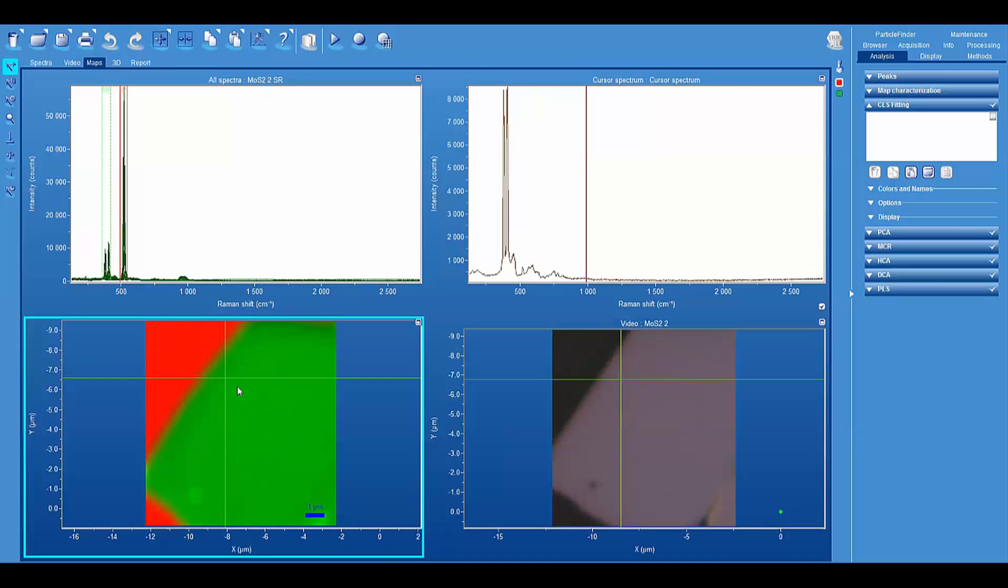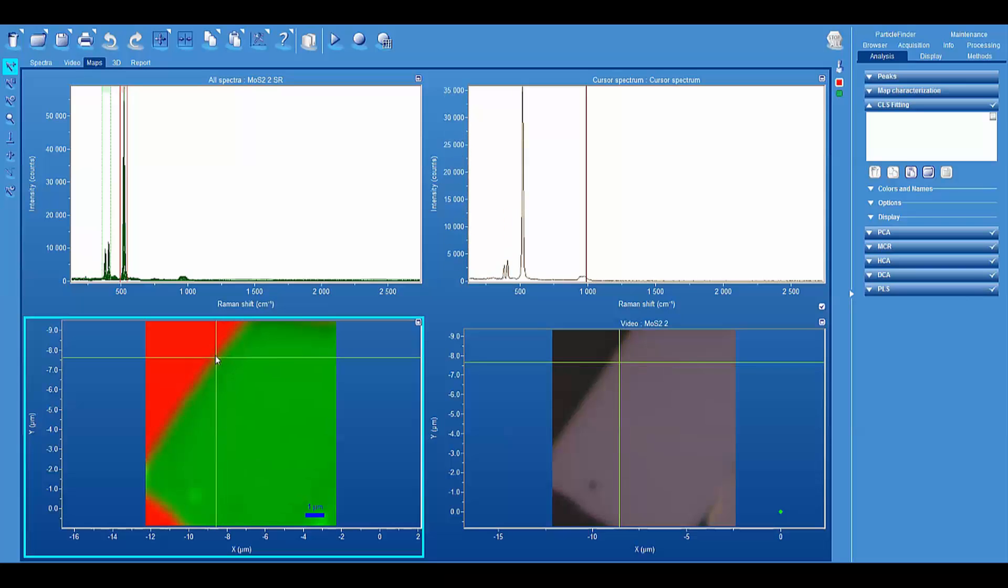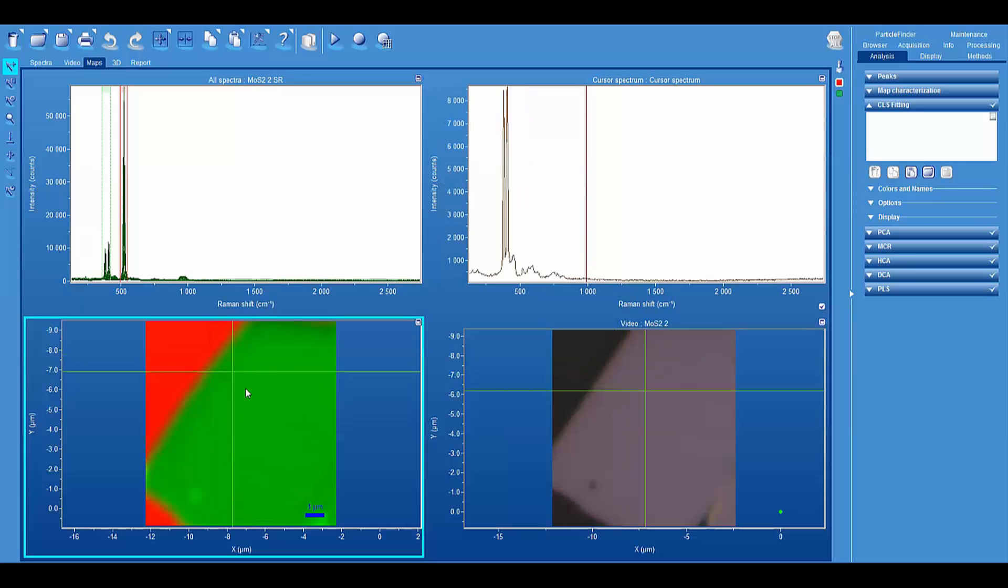So now we see silicon and now we see essentially just the molybdenum disulfide and we get to the edge, then we see some silicon coming through. So the important consideration right here for you is that the image was generated in 300 nanometer increments with one second integration time. And so this entire image took 22 minutes and 59 seconds to generate. And this is what you see using the peak bracket method.